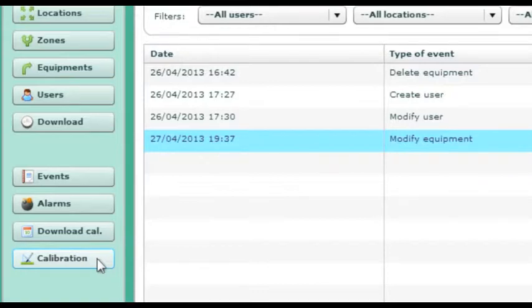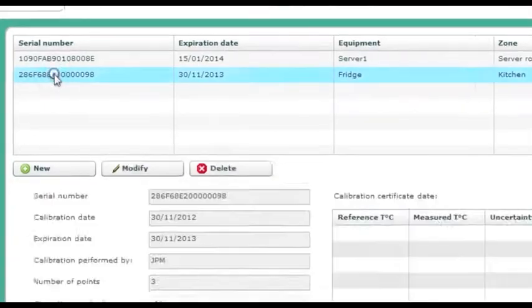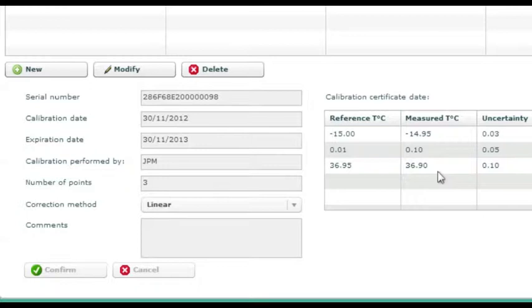With the calibration function, you can enter the result of a calibration certificate. This will correct the values accordingly. We also offer a calibration software delivered with a reference probe, so you can do your own calibration certificates on site.